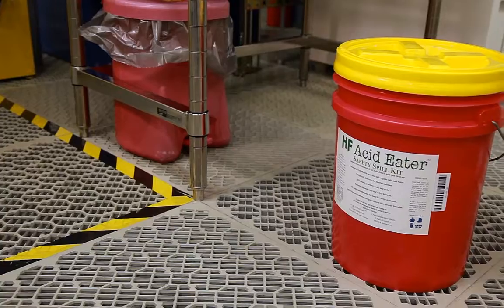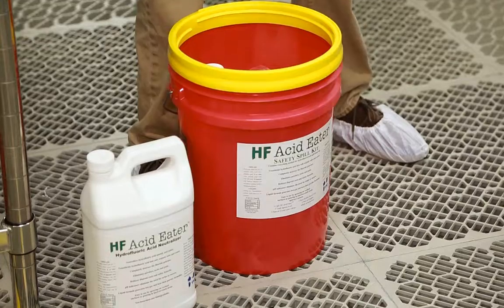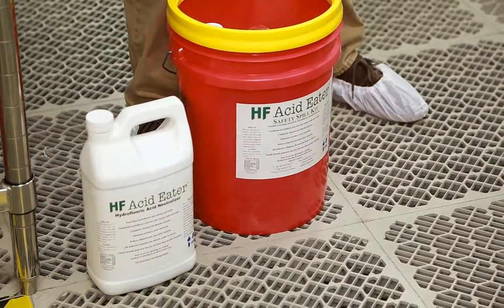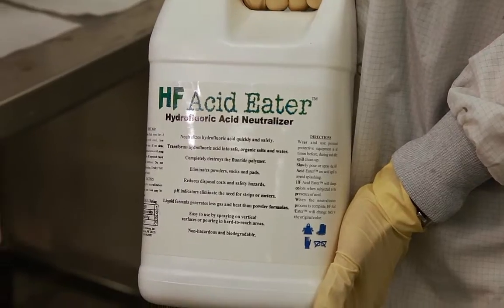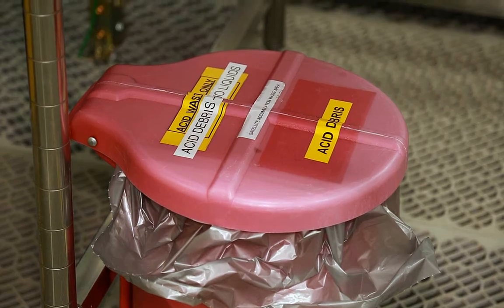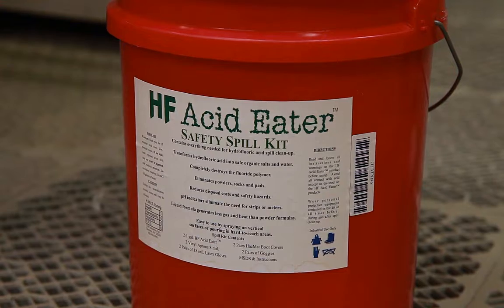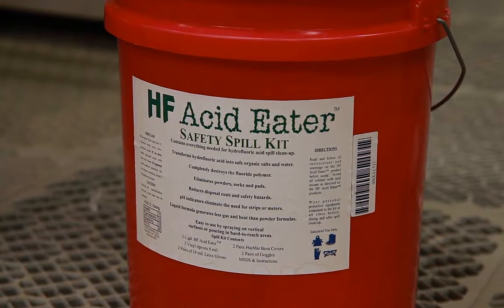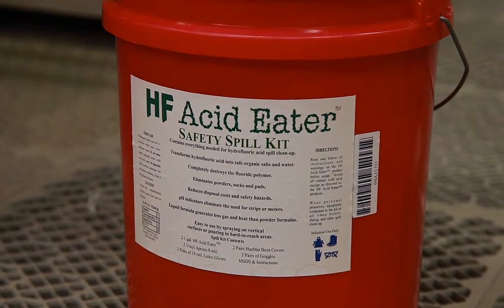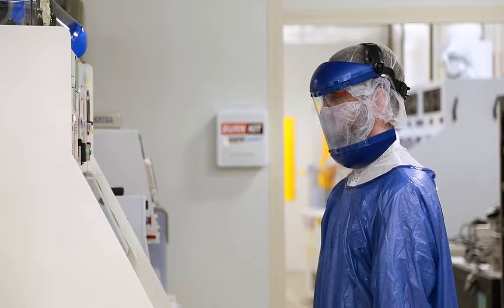HF spill kits shall include fluoride strips, compatible absorbent material, HF-specific neutralizing agent, personal protective equipment, and waste collection containers. Information about how to purchase an HF spill kit and antidote is provided in the course resources folder.